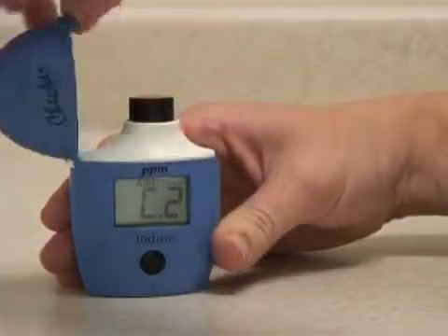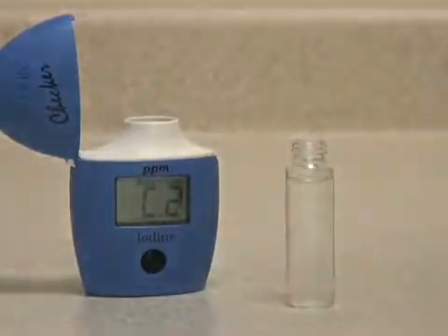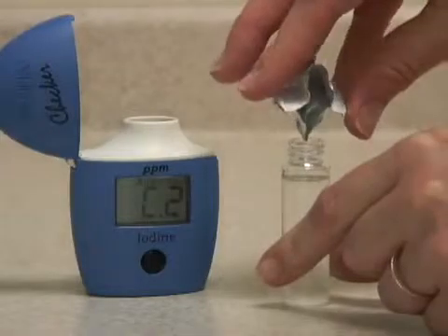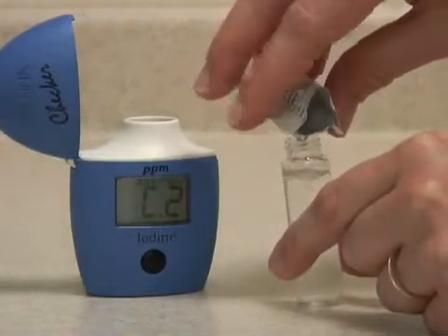When the meter displays C2, remove the vial, open it up, and add your iodine reagent. Try and get as much of the reagent into the vial as possible.